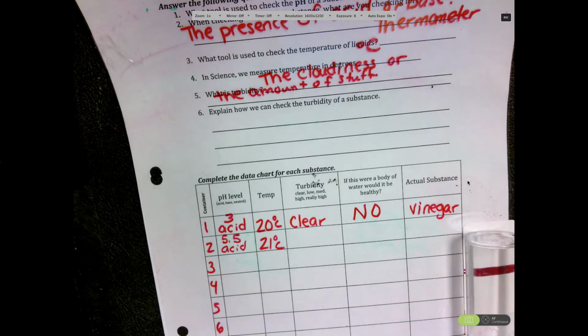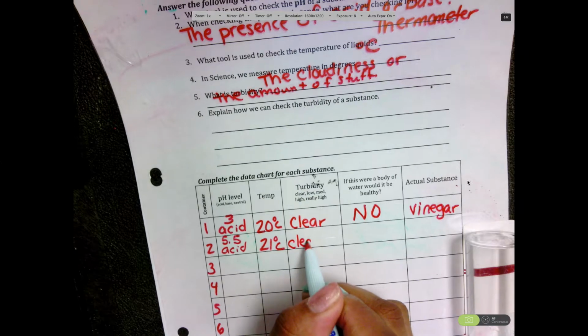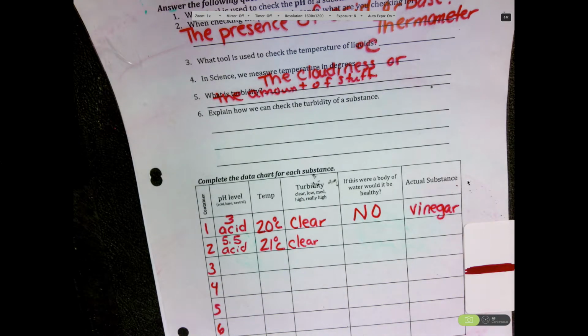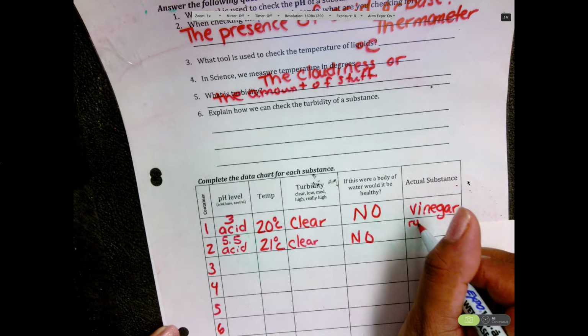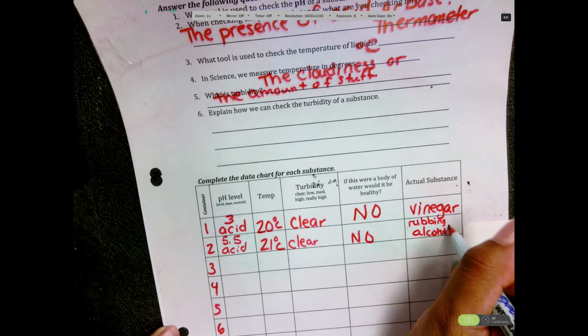Clear. It will be clear. Does it pass the pH? Well, let me go backwards. Does it pass turbidity? Yes. So far we could probably say, yeah, it's healthy. Does it pass temperature? Yes. Does it pass pH? No. And this is rubbing alcohol.